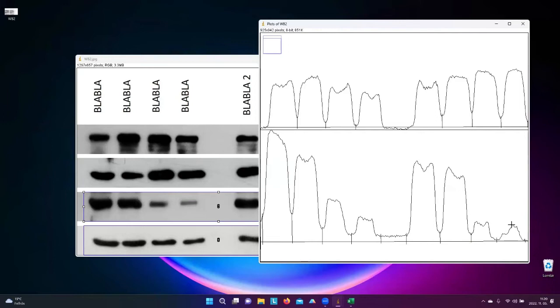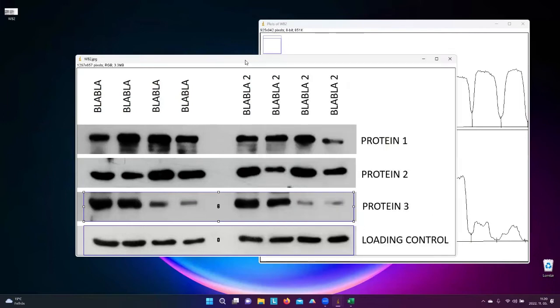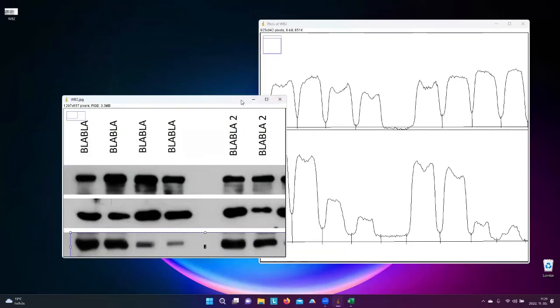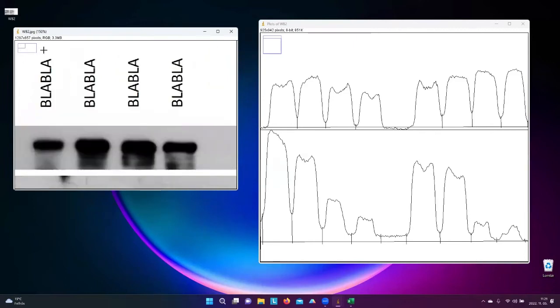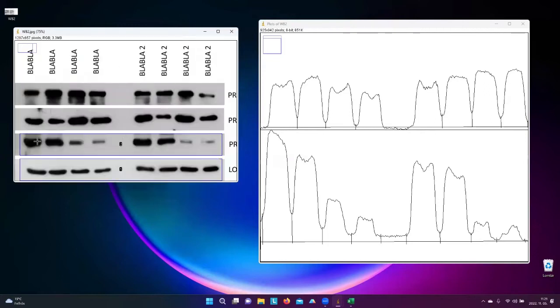And if you have closed everything, now you need to get the data. So in here, if you had 8 samples and also 8 samples here, it works to check the figure. So in the case of the figure, if you see you had 1, 2, 3, 4, 1, 2, 3, 4, so 8 samples are there. And these peaks and the dot size should refer to each other, which means that if this is high, that should be high as well. So now let's see which data you would get.